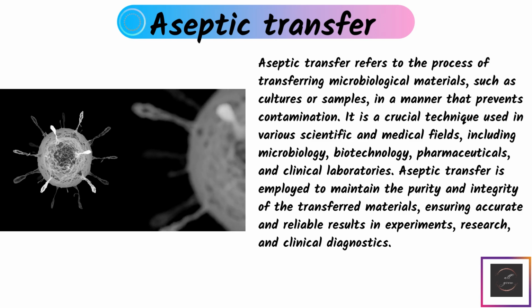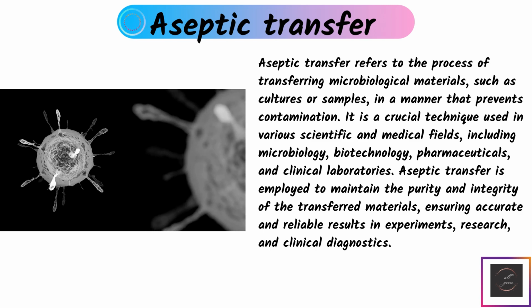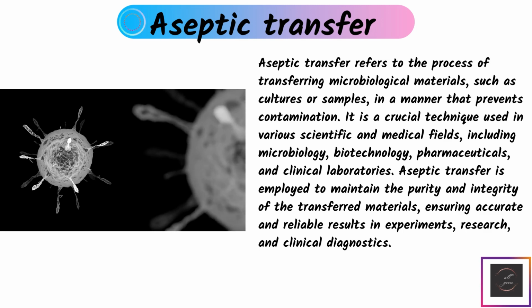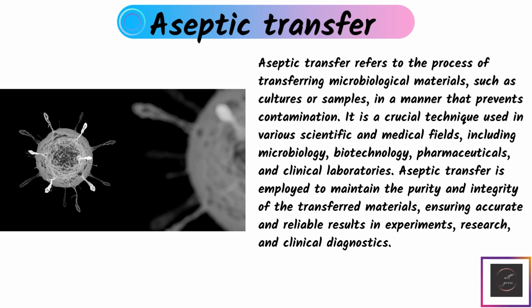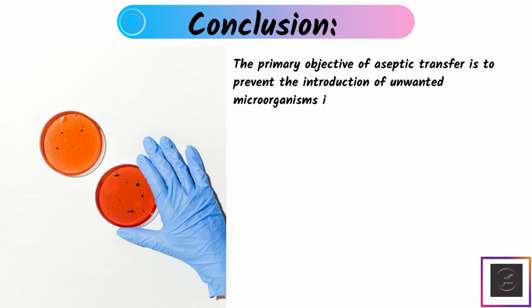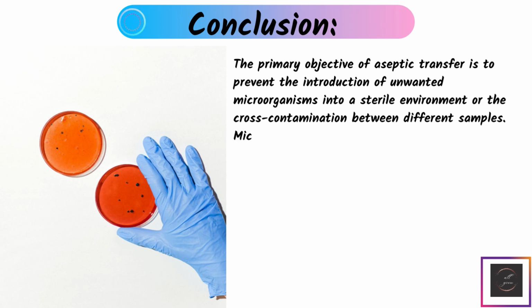Aseptic transfer is employed to maintain the purity and integrity of the transferred material, ensuring accurate, reliable results in experiment, research, and clinical diagnostics. The primary objective of aseptic transfer is to prevent the introduction of unwanted microorganisms into a sterile environment or the cross-contamination between different samples.